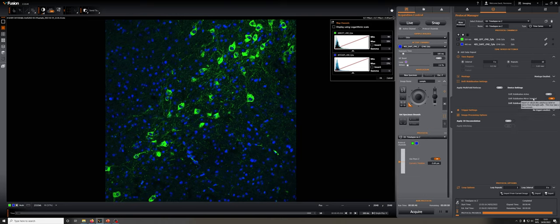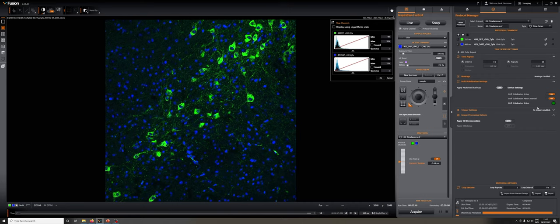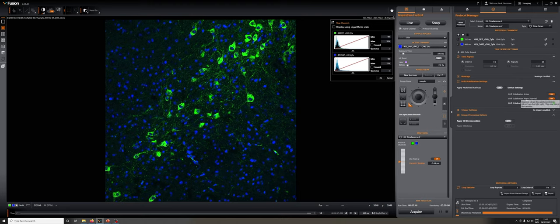So let's see if this works for the sample that we have on here, which is a sample that's in a sort of glycerol-ish mounting media, and we're looking at it with an air objective. And you can see that when I click this, the green light turns on, and that means that drift stabilization is engaged.